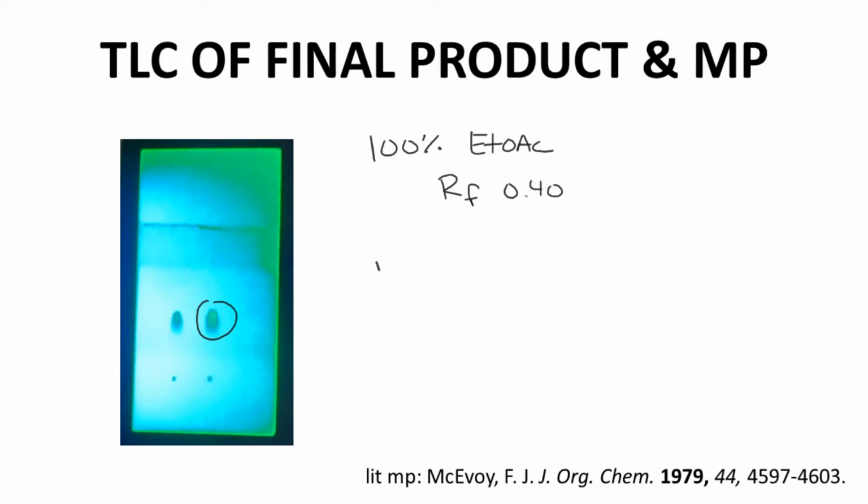The melting range for this product was 242 to 244 degrees Celsius. The melting range for this product is somewhat interesting. If you look up references for our product, most report a melting point of 236. It's rare to get an experimental melting point that is higher than the literature value, but this compound also has a reported melting range that goes into the 240s and even 250.